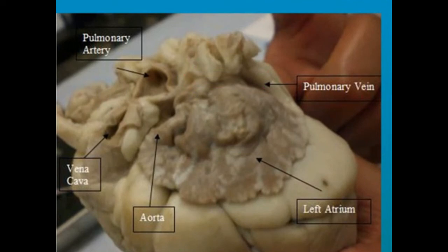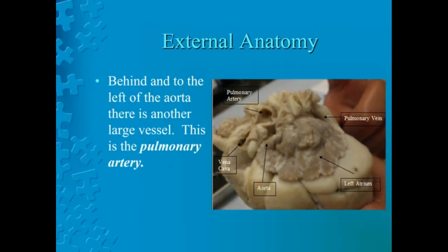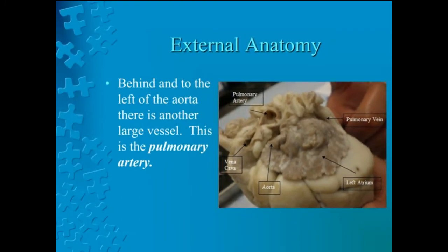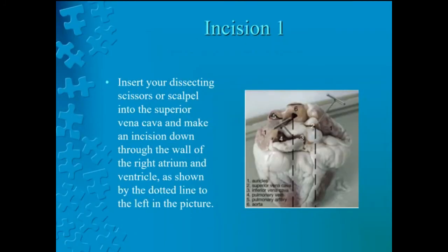Now that we have observed the heart externally, let's begin to look at its internal structure. Insert your dissecting scissors or scalpel into the superior vena cava and make an incision down through the wall of the right atrium and ventricle as shown by the dotted line in the picture. We will pause to make the cut.